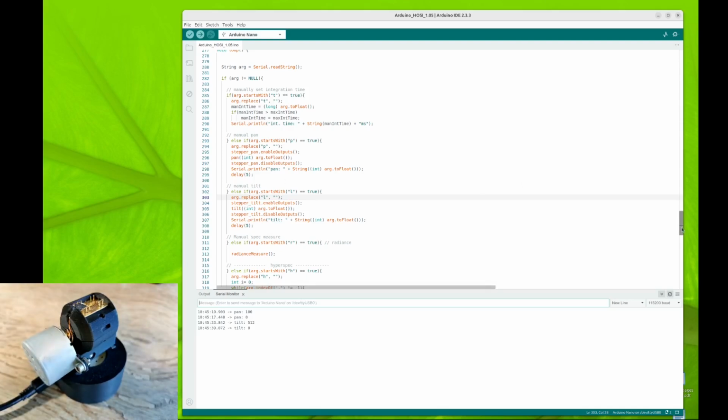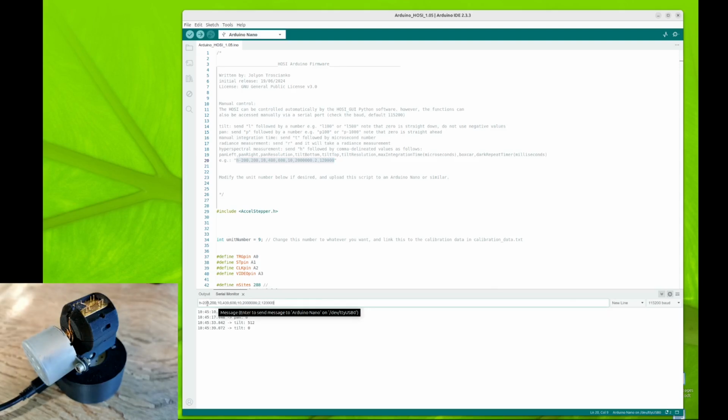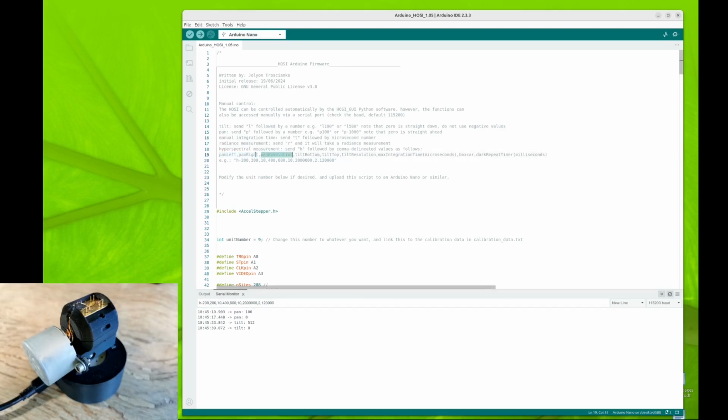Now we can also actually make it take a hyperspectral image using code here. So if it detects a line in the serial command beginning with an H, it's looking for these commands. So if I type in here H, the first numbers are shown here. So that's pan left and pan right, the coordinates of that panning. So here minus 200 to plus 200. And then the pan resolution. And these are all in stepper motor steps. The stepper motor has 2048 steps. It can vary, but that's the standard for this stepper motor, the one I've tested it. They can be very slightly different to that, but that's broadly what you're working with.